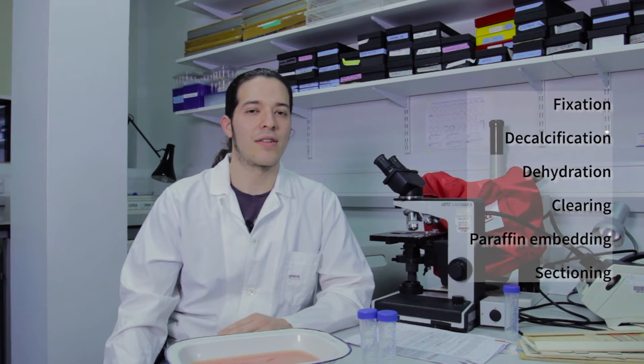The in situ hybridization technique starts with the sectioning of the tissue. In this video, I will show the paraffin embedding technique, which consists of fixation, decalcification, dehydration, clearing, paraffin embedding, and lastly, the sectioning.